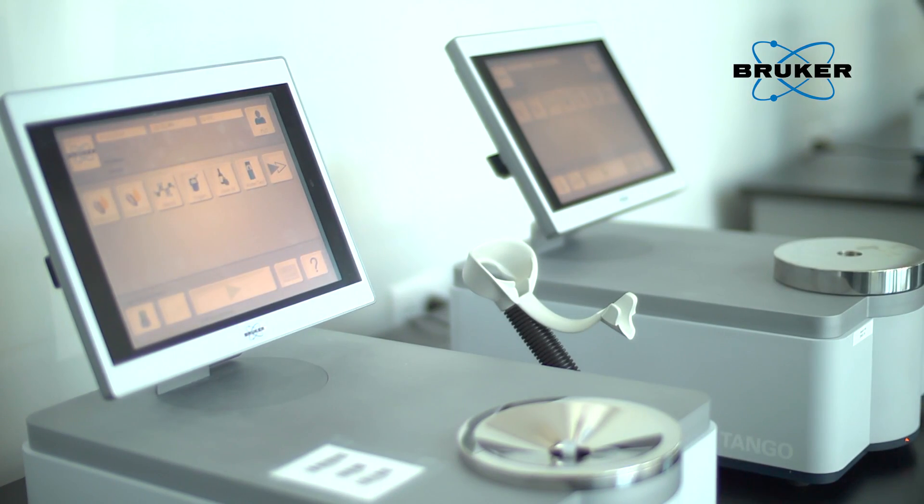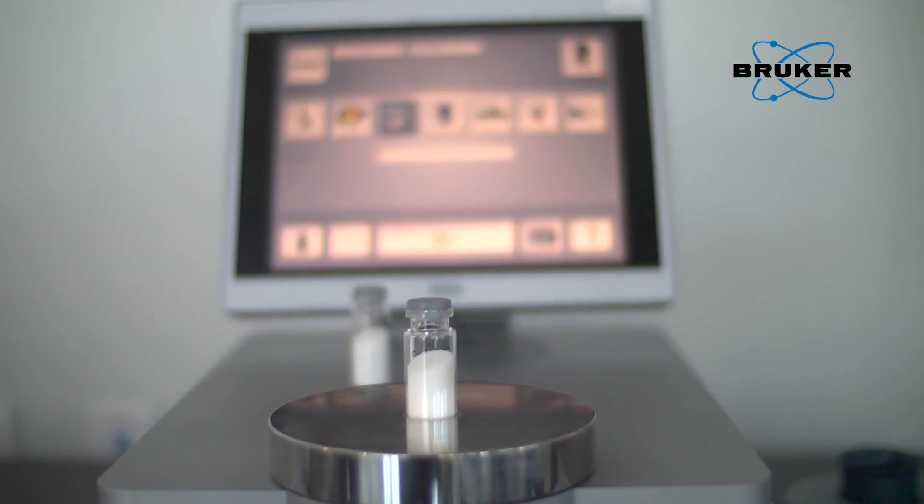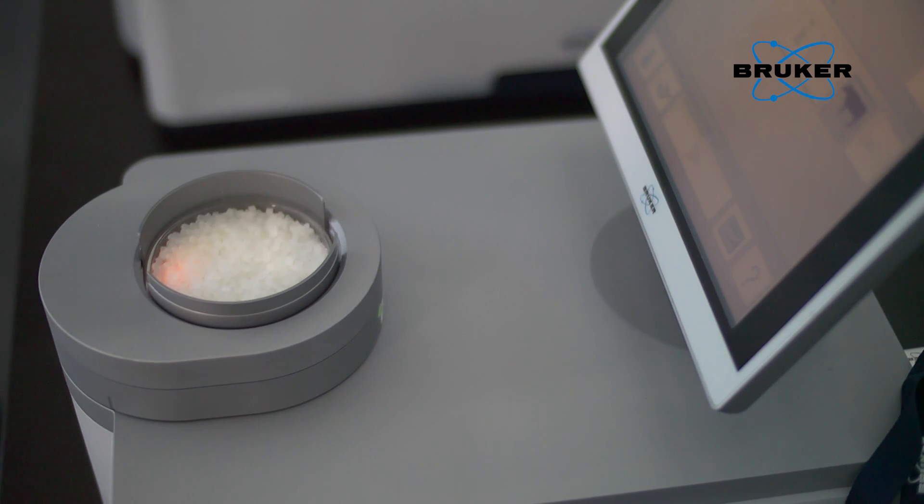The Tango-T is a high-performance, rugged FT-NIR spectrometer which enables fast and accurate analysis for measuring several quality parameters in your liquid chemicals. The Tango-T comes standard with an active heating and cooling system which monitors the vial inside the sample compartment, ensuring that your measurement is at the correct temperature. Temperature settings run from 20 degrees Celsius all the way up to 80 degrees. So analyzing materials such as polyols and derivatives for quality parameters such as OH value, acid number, viscosity, and moisture are easier than ever.